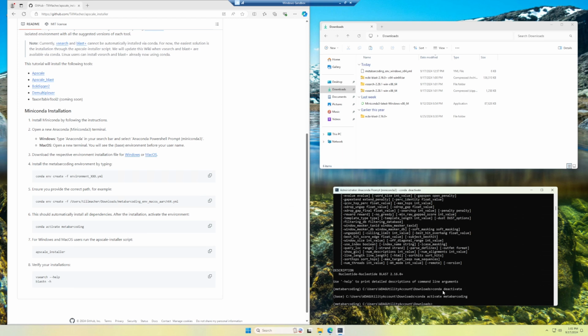And now you can move on to the next tutorial part where I will show you how to use Apscale.